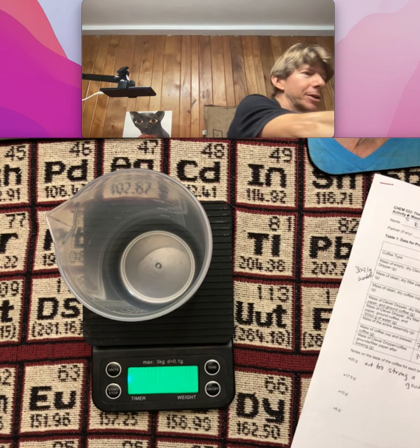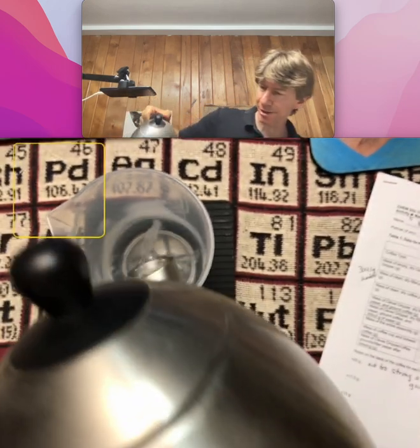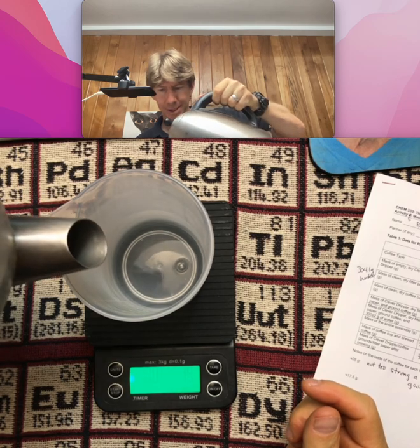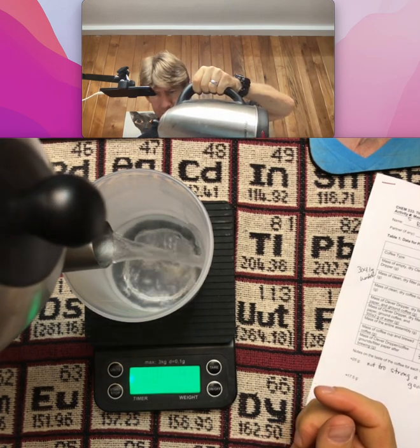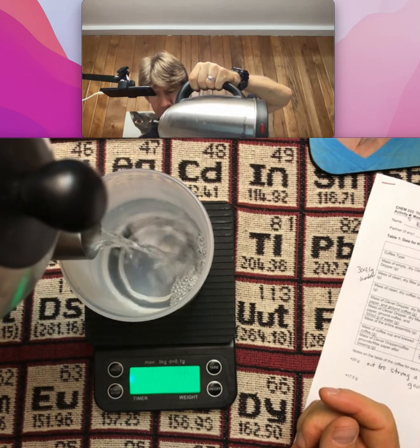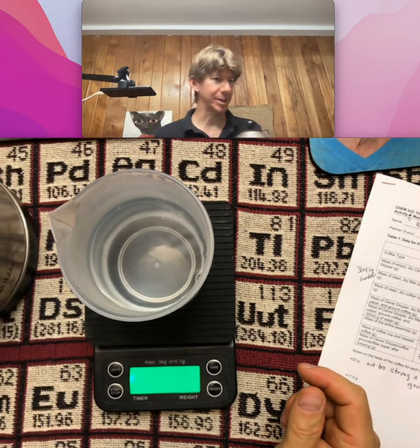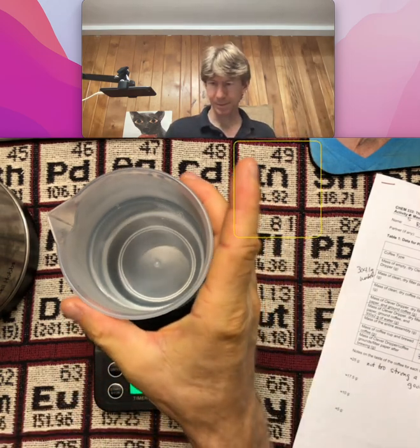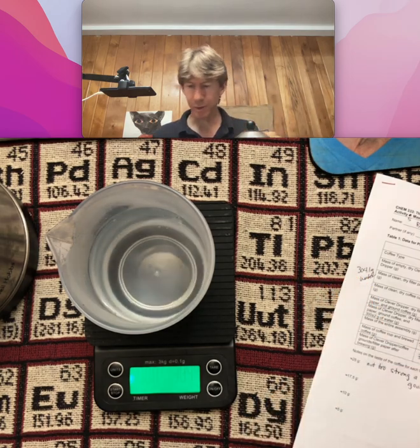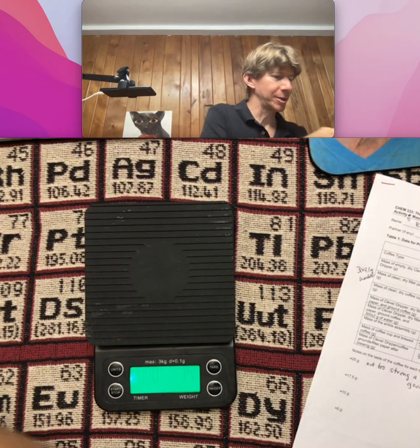Now I'm going to weigh 304.1 grams of freshly boiled water in this. I still got too much. 304.8 is good enough. Now I'll set that aside, working relatively quickly.